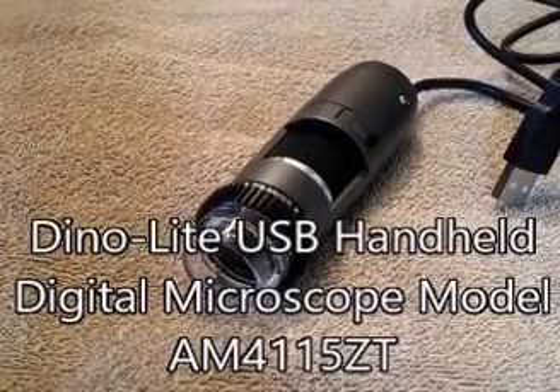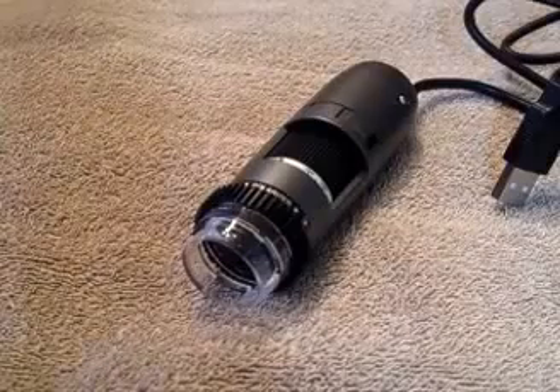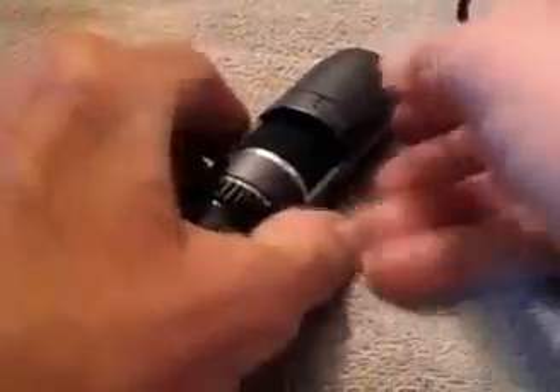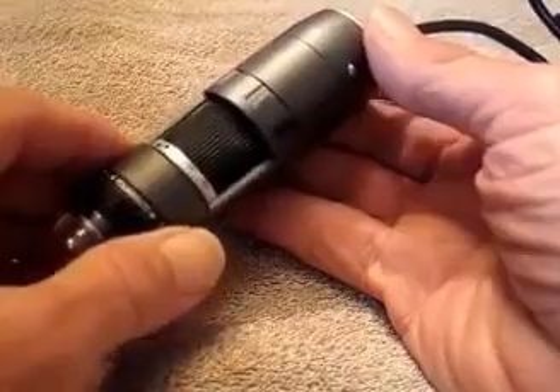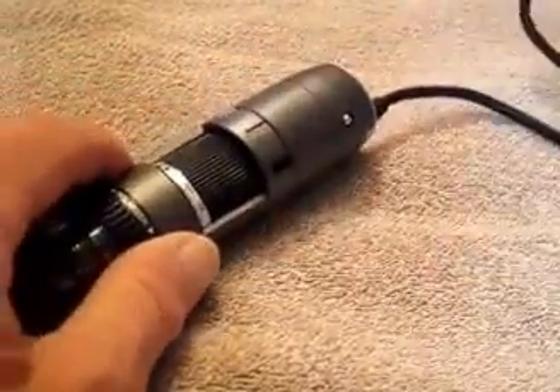We're looking at the Dino-Lite USB handheld digital microscope, model AM4115ZT. Here it is — gives you an idea of the size of it. I'm just going to go over some of the main features and then we're going to hook this up to my computer and see what it'll do.